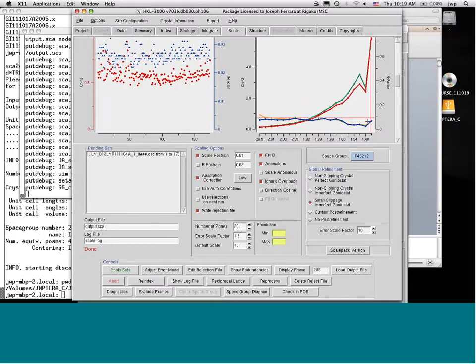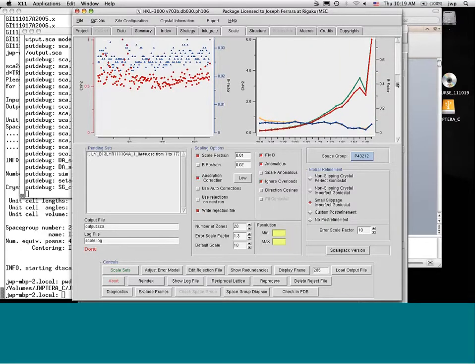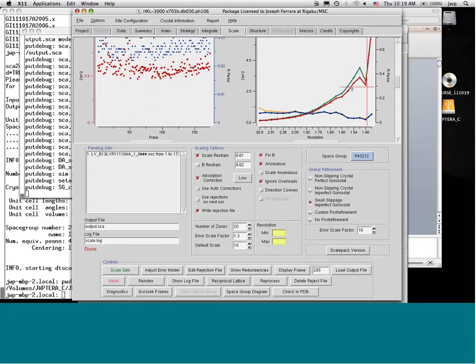Here in this panel, the red and green, and the blue and yellow, are telling us something about the anomalous signal. So the blue and yellow are the reduced chi-squared for reflections in these batches, and I'll give an equation for what the reduced chi-squared is in a moment so you can completely understand that. The yellow is when I plus and I minus are combined.